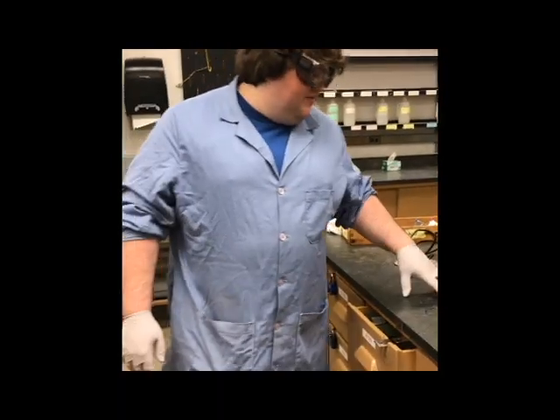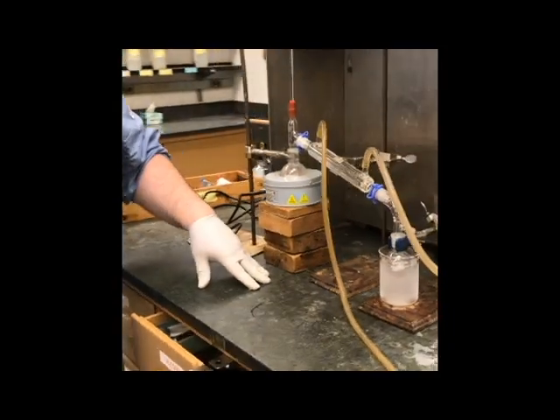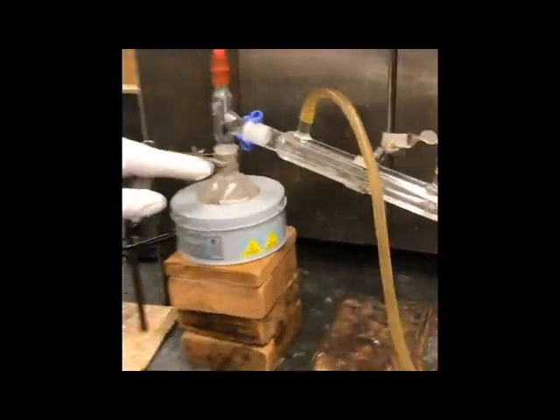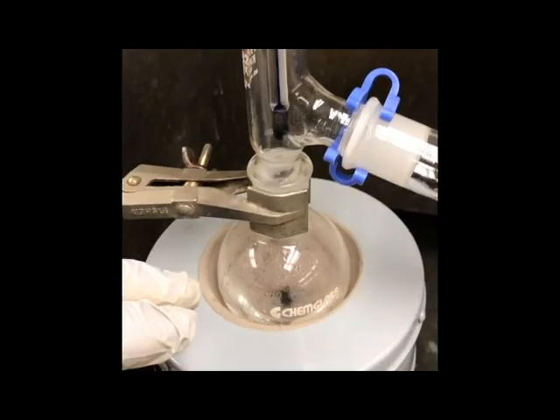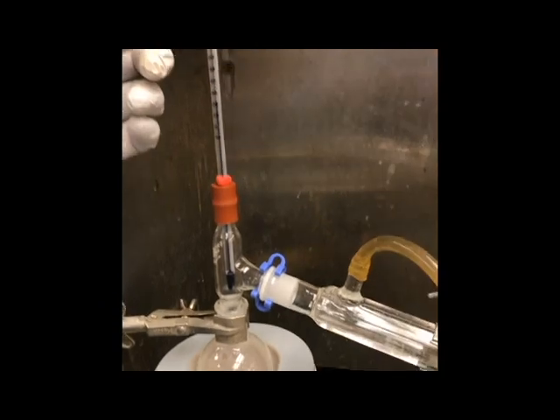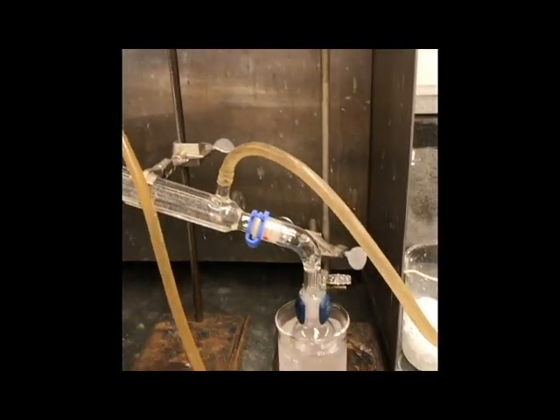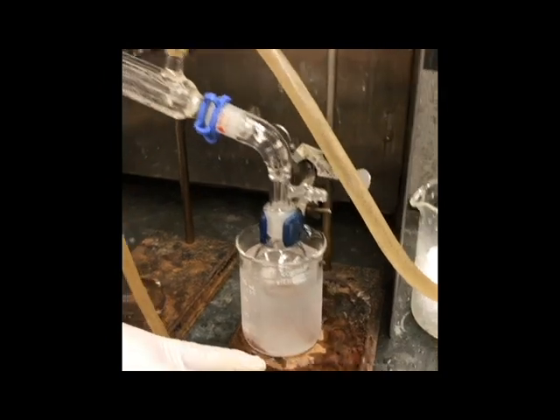Okay, so now we have been swirling for 5 minutes. What we have done is we put a few boiling chips inside of our reaction flask right here. What we want to do is keep our temperature below 100 degrees. And we also want to keep our receiving flask nice and cool. We've done so by adding an ice bath in here.